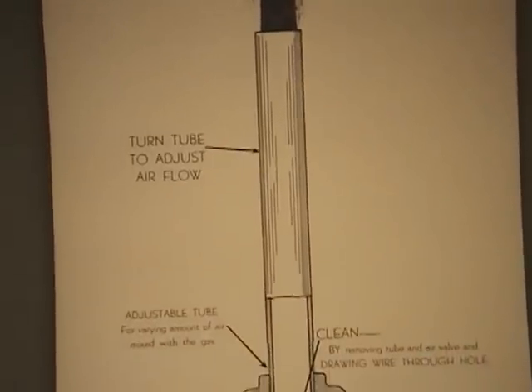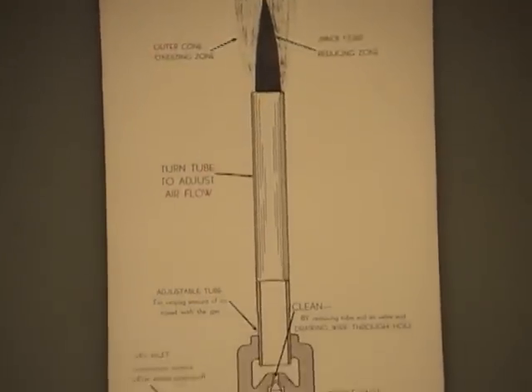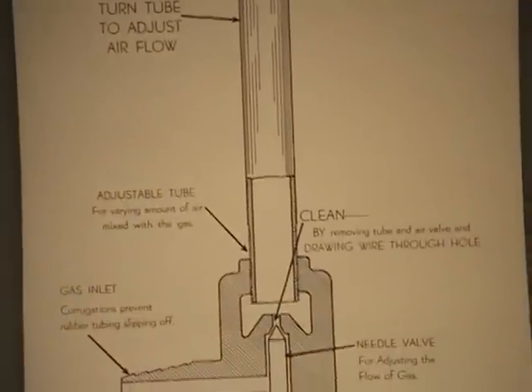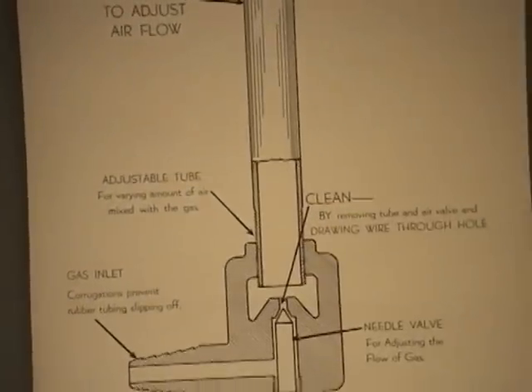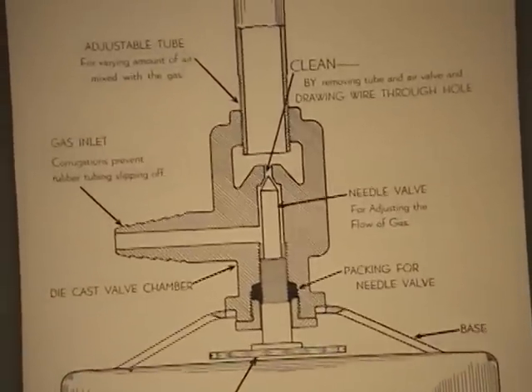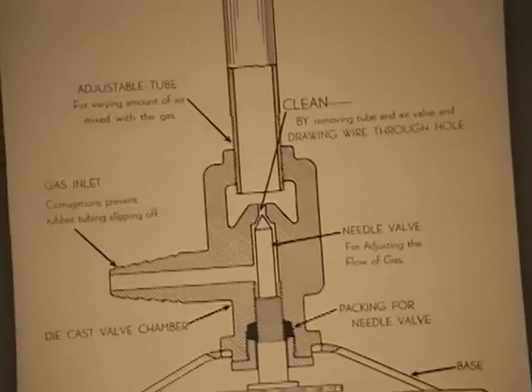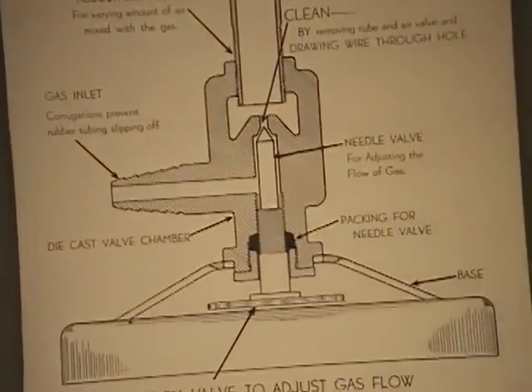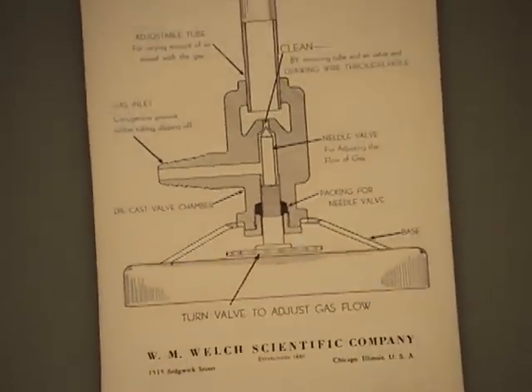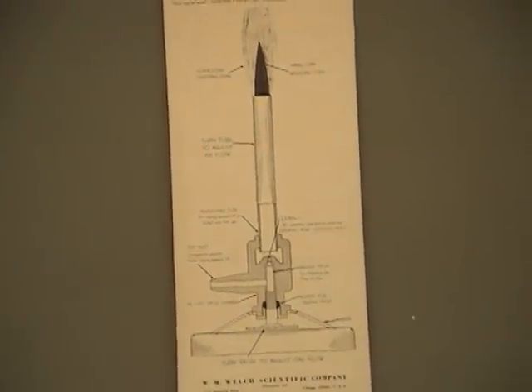We can clean the Bunsen burner, and should clean it, by keeping the air valves open and running a wire through it. There are gas inlets where the natural gas comes in — they're corrugated or rough so the rubber tubing will not slip off. There's a needle valve inside for adjusting the flow of gas, with packing around it so it doesn't leak. If you notice a leaking Bunsen burner, let me know — we'll get it replaced and fixed. We can turn the valve to control gas flow, and it all sits on a base. We have two different styles of Bunsen burners available; the one I provided you is slightly different than what's on this poster.